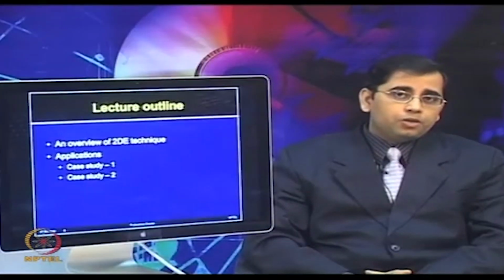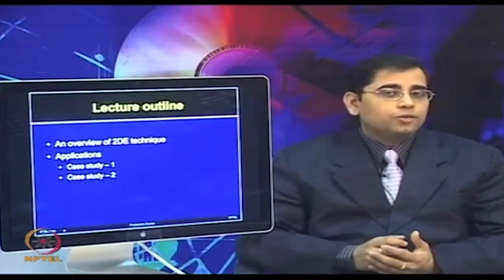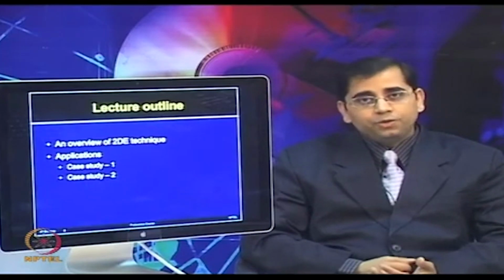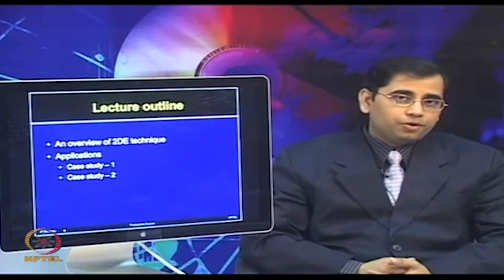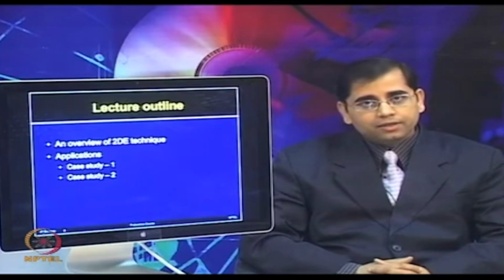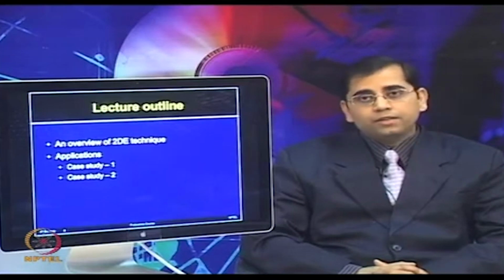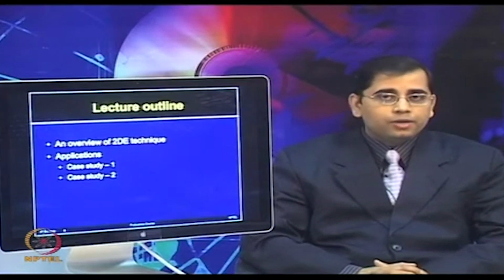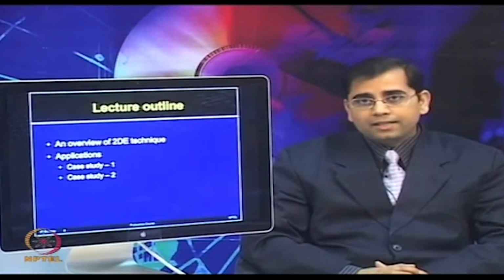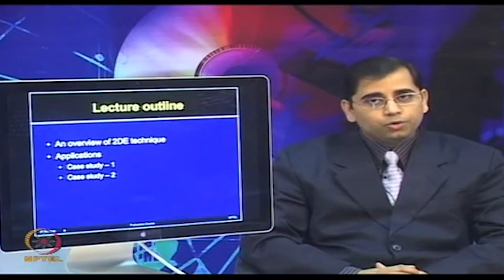Now, this two-dimensional electrophoresis technique is widely applicable in almost all areas of biological sciences. You name any application and you will see there are published reports using two-dimensional electrophoresis or difference in gel electrophoresis, whether it is looking at different human diseases, drug responses, investigating plant stresses, or any drug treatment in bacterial species or other microbes.